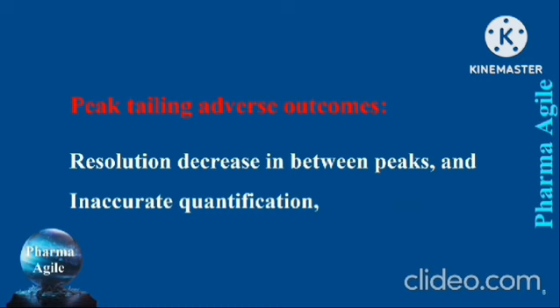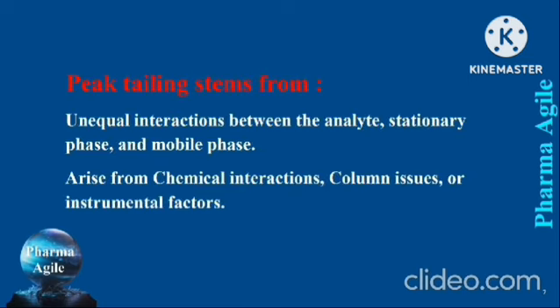Here I will discuss the primary causes of peak tailing. The main cause of peak tailing is the occurrence of multiple mechanisms of analyte retention, with the analyte interacting strongly with ionized silanol groups on the silica support surface, leading to tailing peaks. Peak tailing stems from unequal interactions between the analyte, stationary phase and mobile phase. It can arise from various factors including chemical interactions, column issues or instrumental factors.